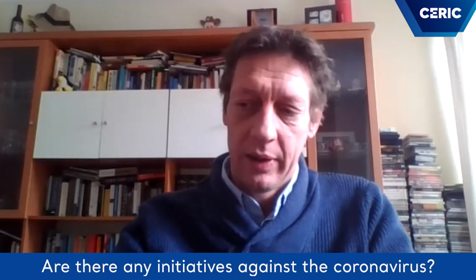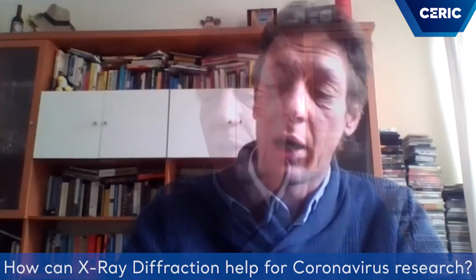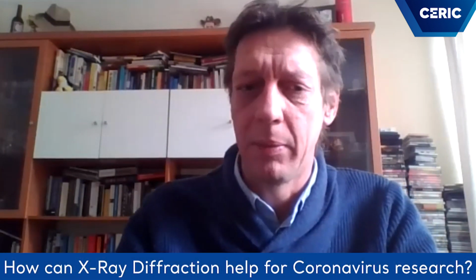We opened Fasttrack access both through Elettra and through CERIC to the beamline if there is the request for MCX. XRD can have a large impact. There are more XRD beamlines at Elettra. There are 4 actually. One is a high pressure, which in this case is probably not so relevant. My beamline is powder diffraction, which can be relevant, but usually in a later stage.